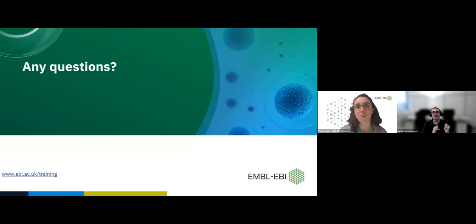So, the raw data directly? No, or at least not just by dragging and dropping the folder with the raw data into Napari.